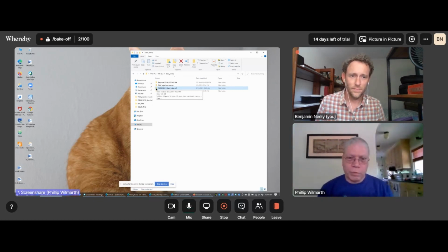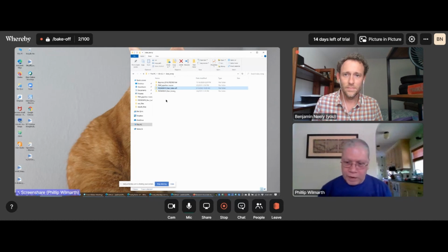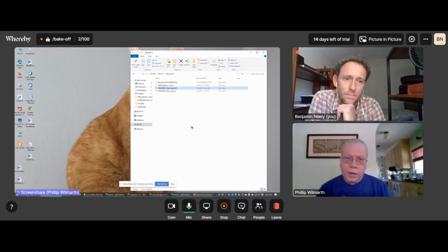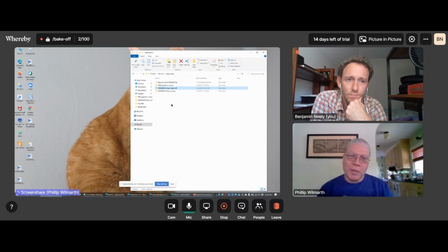ProteoWizard is a little more formal installation and actually installs in a folder in your system files. So you kind of have to know where those things are and then basically point the scripts back to them. And I've got a little description about how to set up some Windows batch files in a folder that you put on your Windows search path so that you can create one level of indirection to where those tools are installed. You don't have to worry about putting in a specific path to the actual tool itself. You put in a path to the batch file. So it's a way to decouple. You can update your ProteoWizard package more easily that way without having to mess with the script.